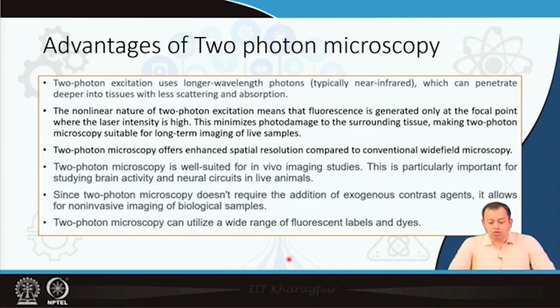So, two photon microscopy uses a nonlinear process, in which two or more photons can be sent, each having half of the energy or each having intermediate energy. Remember your nonlinearity lecture from the laser for biophotonics module.